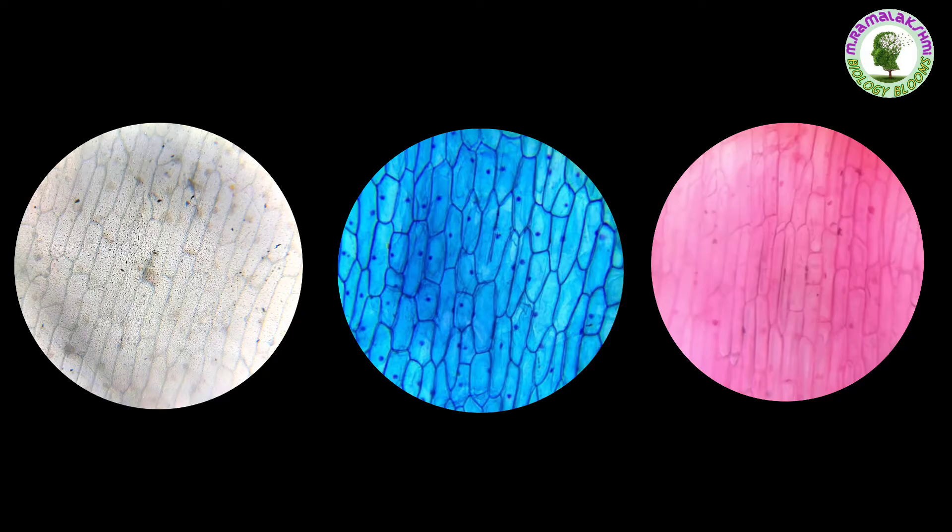A plant cell contains a large vacuole which occupies 80 percent or more of the space, so the nucleus, despite being at the centre, is pushed to a position near the cell wall.